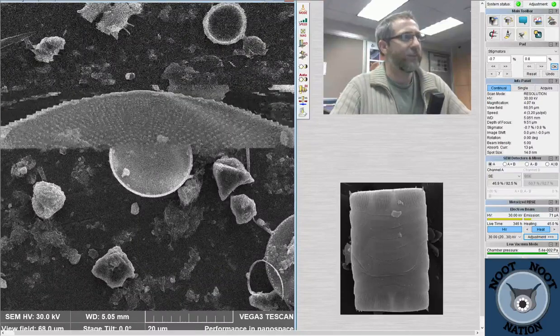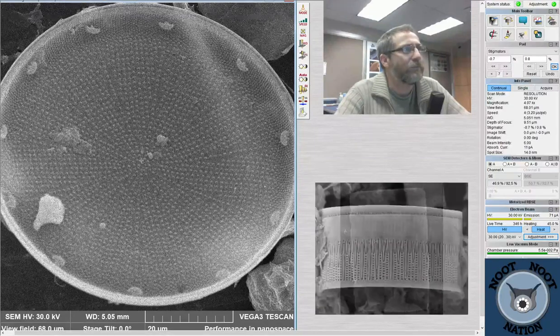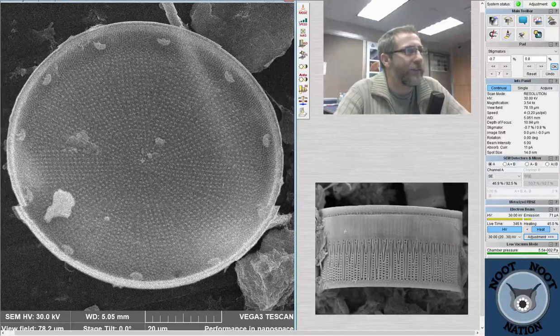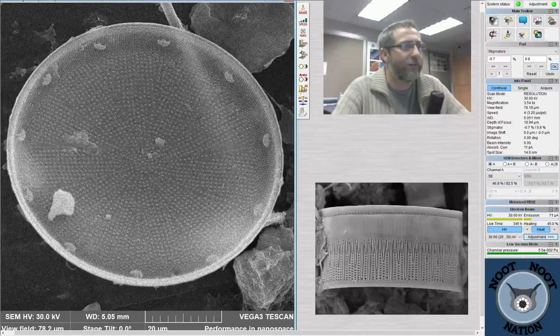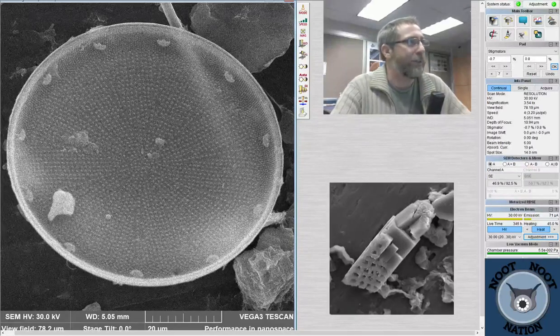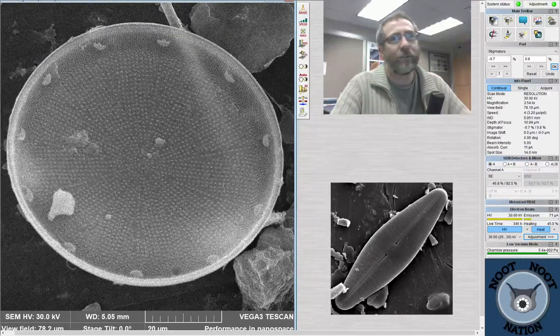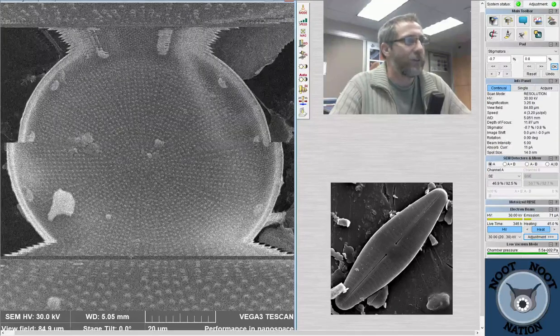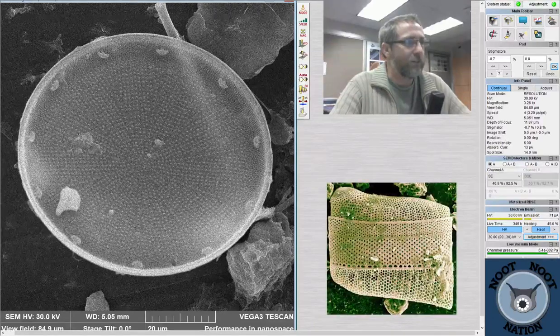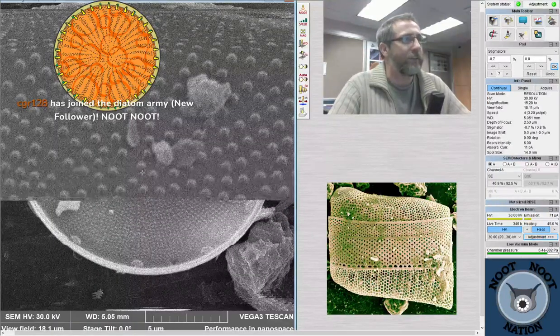Here's a nice Actinocyclus again. So we started out looking at an Actinocyclus. This one's got a little bit of junk on it. If you were here at the beginning of the stream, we saw an Actinocyclus that was even worse with respect to the junk covering it. And I told you that there was a ring of rimiportula, which are these trumpet or fan-shaped things around the outside edge. And I'll apologize for the quality of the image. It will get better in a second. I also told you that in Actinocyclus, we saw this exact same species, that there should be a little nodule called a pseudonodulus. It's right there. So, you know, I got the genus right on this one.